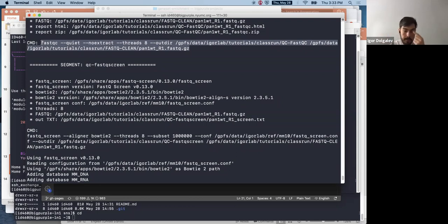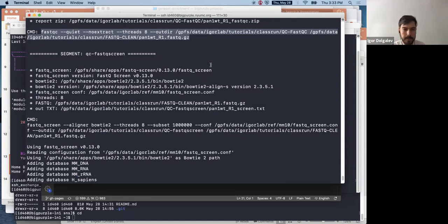From my standpoint, should we really be doing this one by one, or should we do this automated protocol, which I don't have a problem with. I think all various tools are built on top of other tools. So really, there's no reason to draw arbitrary distinctions about what is the low level enough protocol.